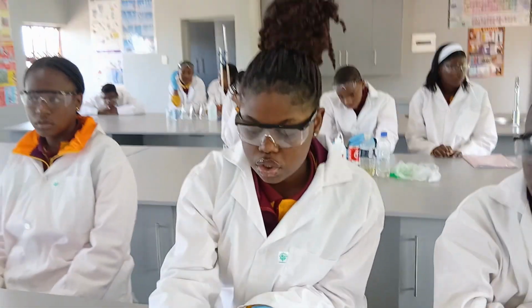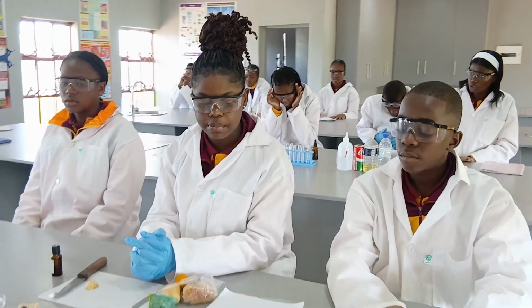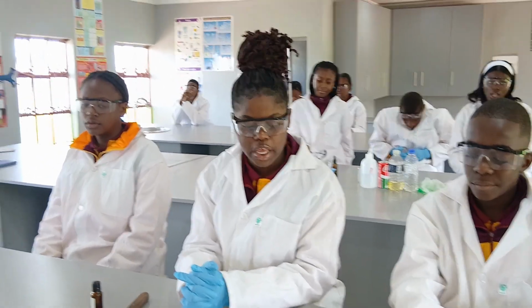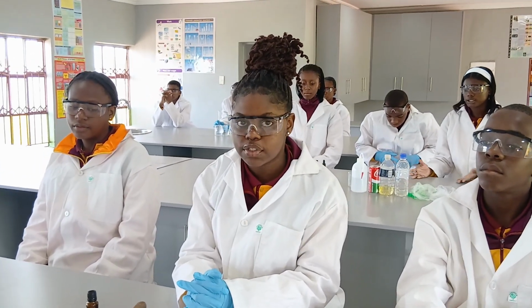So in conclusion, we are going to say that if the food sample stays yellow-brown, it means that there's absence of starch, and if the food sample turns blue-black, it means that there's presence of starch.